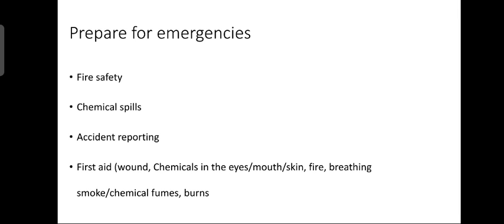Okay. Next one is breathing smoke or chemical fumes. All experiments that give off smoke or noxious gases should be conducted in a well ventilated fume hood. This will make an accident of this kind unlikely.